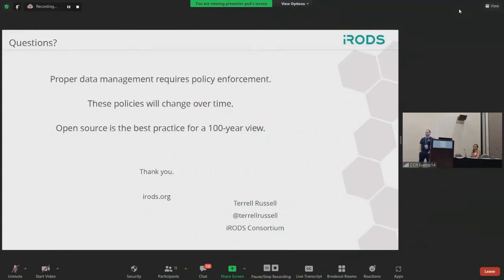As I walk this over to Ben, I just wanted to comment, kind of translate what Terrell had said. What we're working on right now is an automated import from the microscope where it's tagged as raw. It goes to a long-term storage place. Maybe automated stitching happens. Only that file gets moved to OMERO. So the users are not seeing as much duplication, and it's doing the automated trim and publish. Same thing for publishing. Only the raw will be saved. It's linked to each other, but the only thing that gets published on the published one is the very final data with the metadata included.